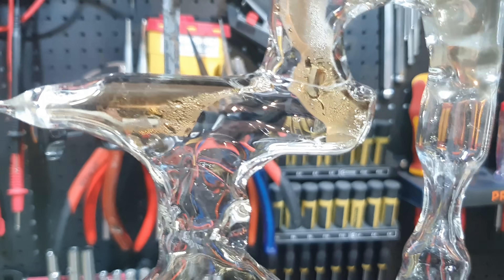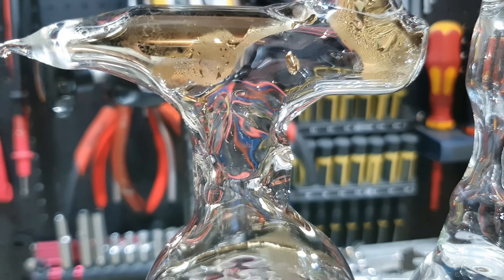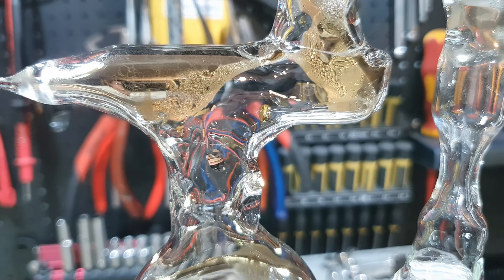You will now see some astonishing shots of the second distillation. Again, if you want to skip, you can click on the next chapter.